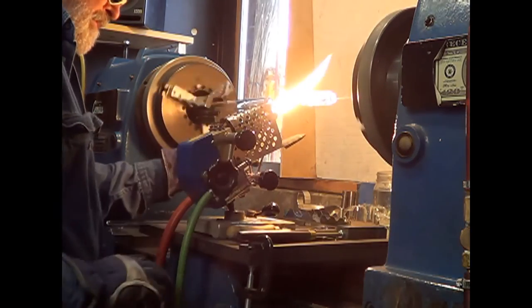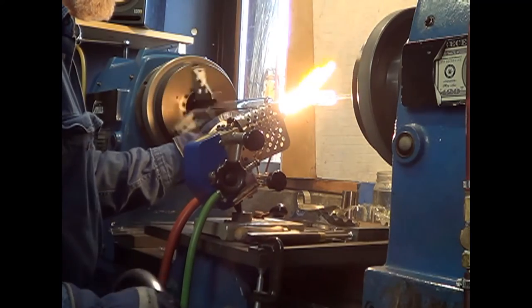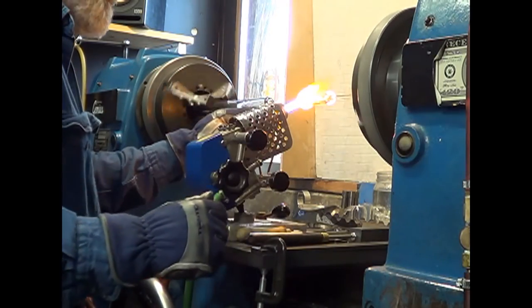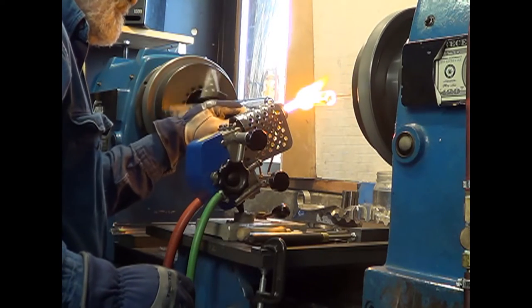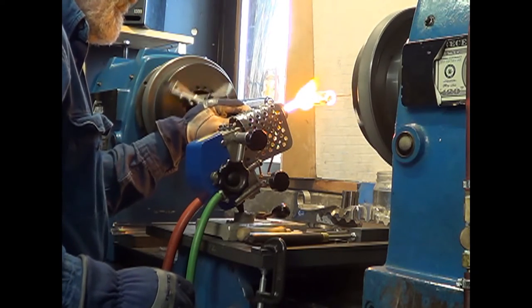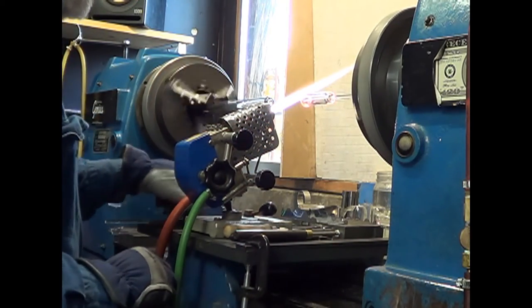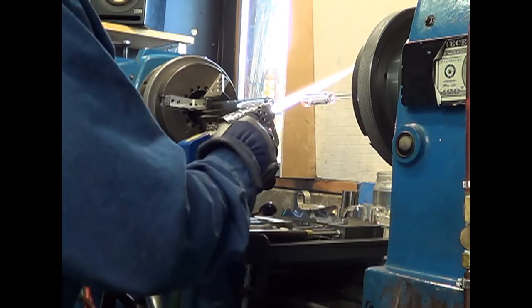And I'm going to take a carbon tool — a pointed tool — and I'm going to work that tube and open it so that it's nice and even all the way around. So that's my assignment for the day: to make as many of these tubes as I can, approximately 2 and 3 quarter inches long.